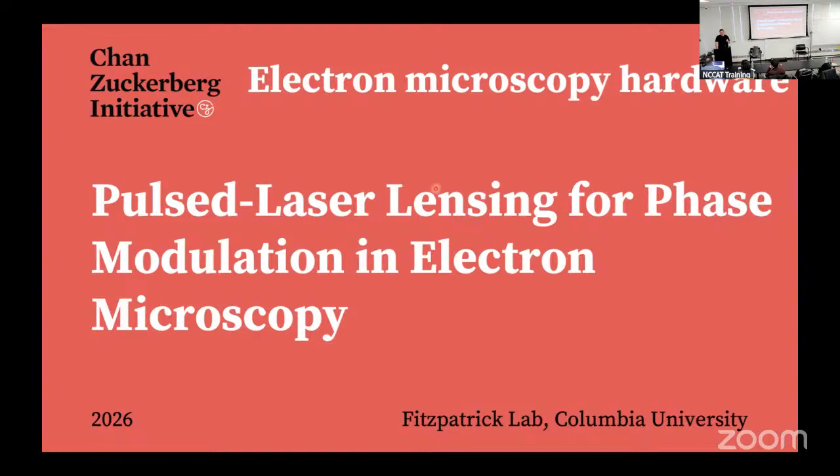And so one of the alternative ways that we are thinking about trying to improve, certainly cryo-ET, is to use another source of electromagnetic radiation on top. An electromagnetic field is also generated as part of a laser. So in addition to the magnetic lenses, we're trying to use lasers to manipulate the electron beam in order to generate better images for cryo-ET.